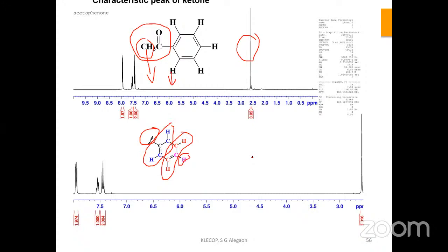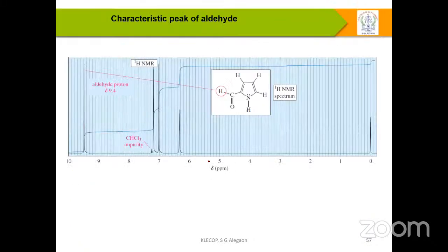Usually in these 3 different signals we can get a doublet and triplet, or a doublet and multiplet. This doublet is a very important blue proton that we are going to observe, and then coming to the magenta, we are going to get the red protons. So in this way one can very easily elucidate acetophenone. Most of the people wrongly distribute these hydrogens. Usually these hydrogens are similar, but they have a coupling constant with these protons.